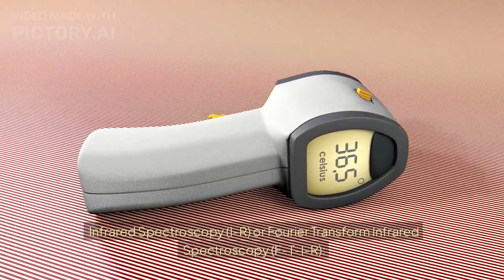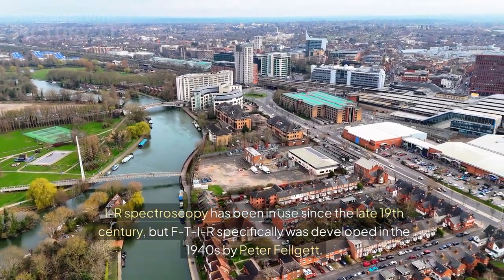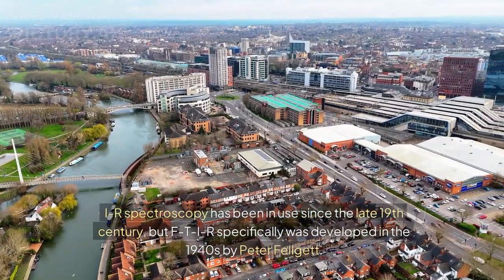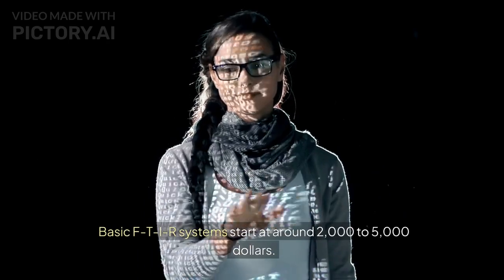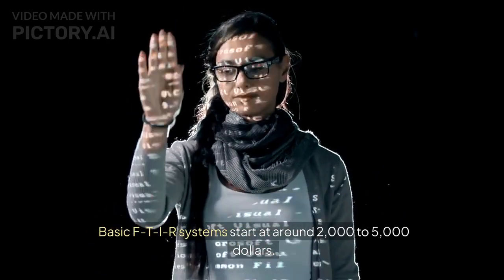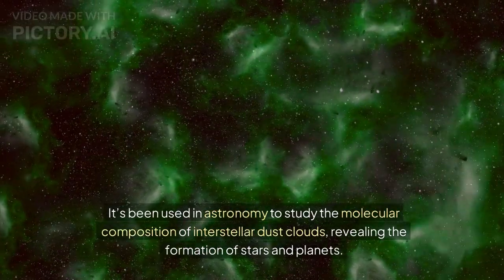Infrared Spectroscopy, IR, or Fourier Transform Infrared Spectroscopy, FTIR. IR spectroscopy has been in use since the late 19th century, but FTIR specifically was developed in the 1940s by Peter Fellgett. It's used to study molecular bonding and functional groups. Basic FTIR systems start at around $2,000 to $5,000. It's been used in astronomy to study the molecular composition of interstellar dust clouds, revealing the formation of stars and planets.